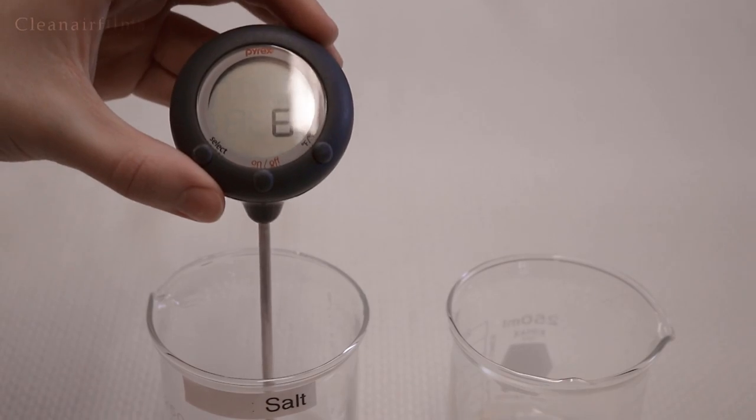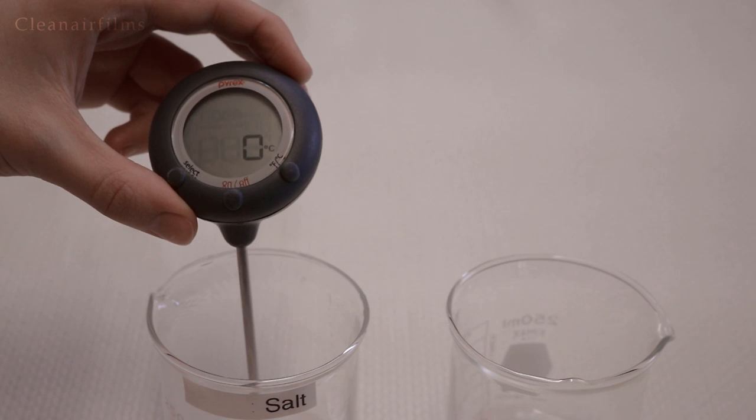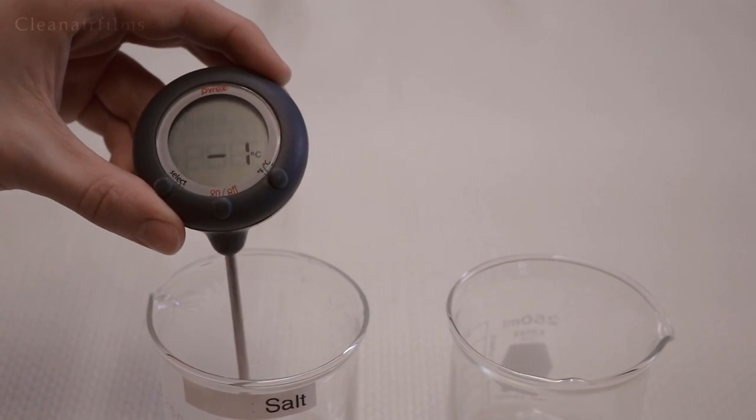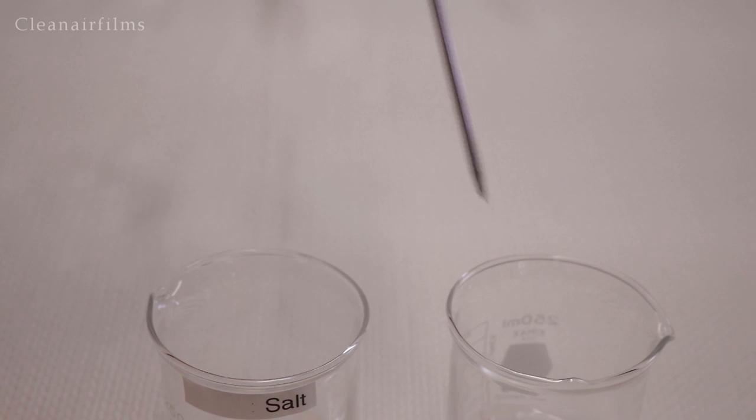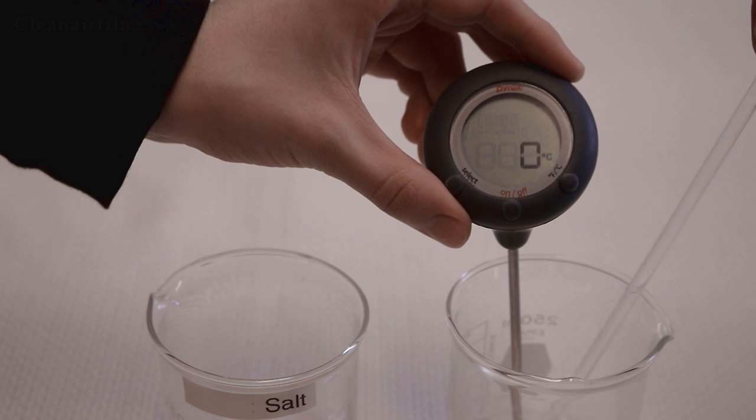Let's use the thermometer to measure each beaker's temperature. The salt water solution is measuring negative one degrees Celsius. The plain water is reading zero degrees Celsius. That is the freezing point.